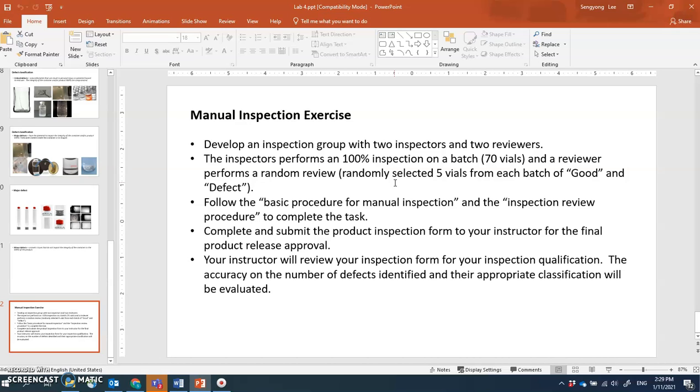I'll give you an inspection form and handouts. You will identify all the defects, place labels on them with the identification codes for what defect each one is, and then fill out the inspection form. Once that's done, I want you to cross-examine the inspection done by another group.